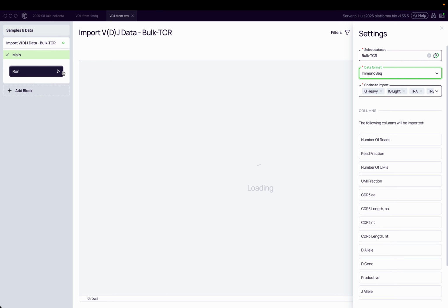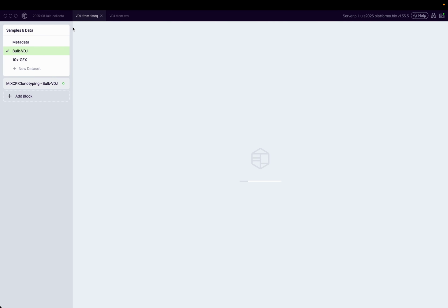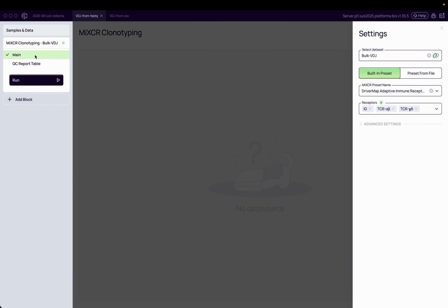So once we did this, either by importing VDJ data or by analyzing it with MiXCR Clonotyping, we are ready for downstream analysis that we will cover in the following videos.